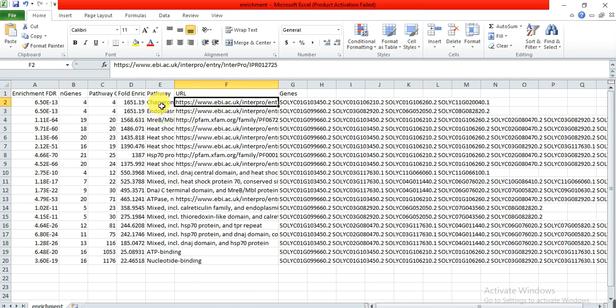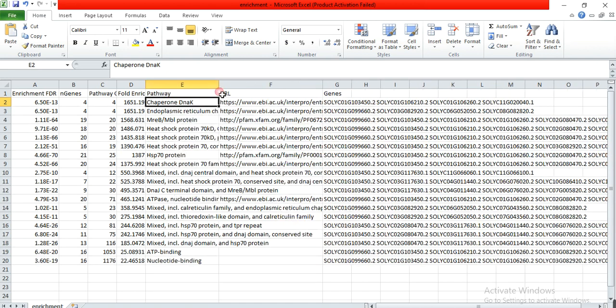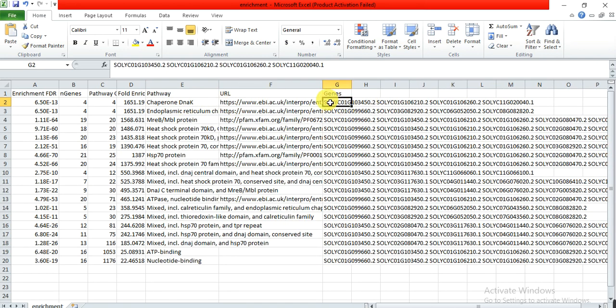This is the function or which function these genes belong to. These are the list of these genes. My family has about 25 or 30 genes, and of them, these four genes belong to specific pathways.